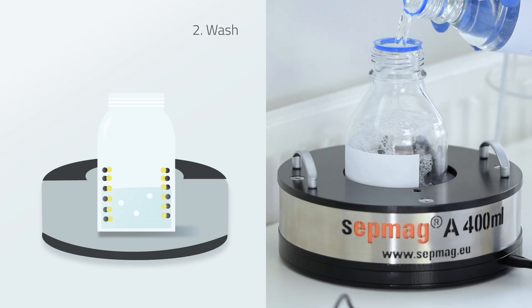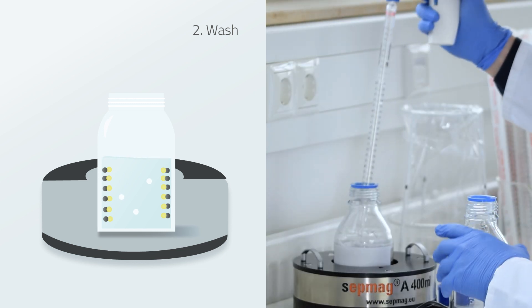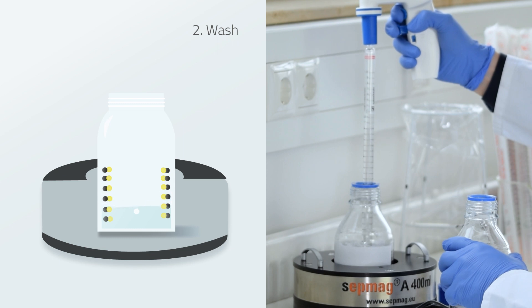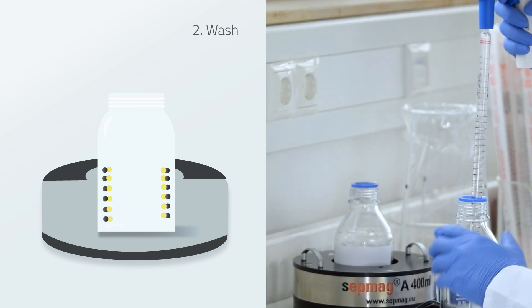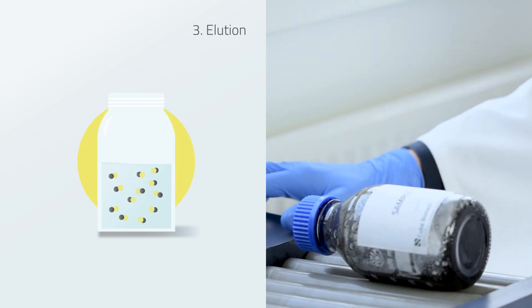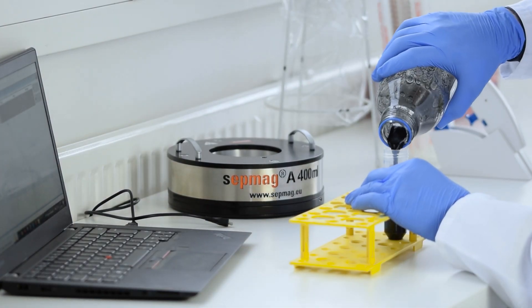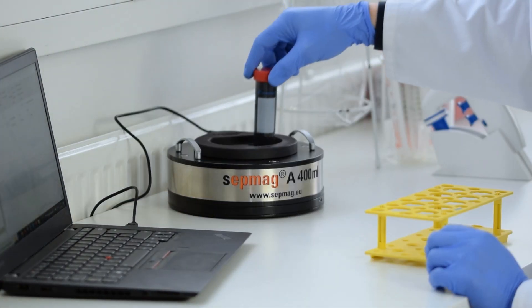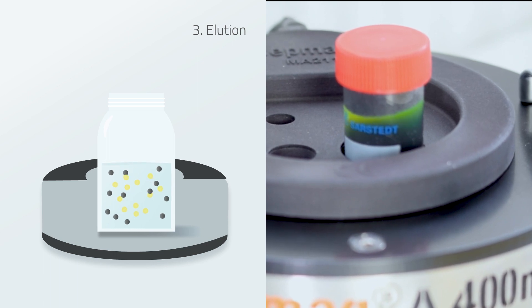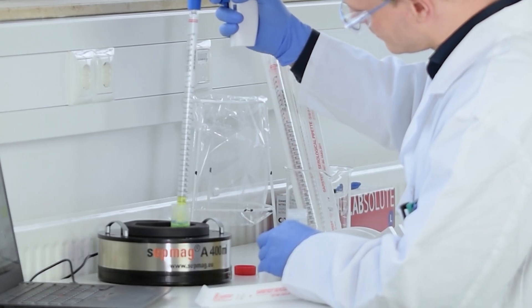Subsequently, wash the MAC beads at least two times with the washing buffer. To elute the protein, add the elution buffer. Let the mixture incubate, then place it into the system. The sample will turn yellow again because the MAC beads are held away from the GFP. Now the purified GFP can be collected.